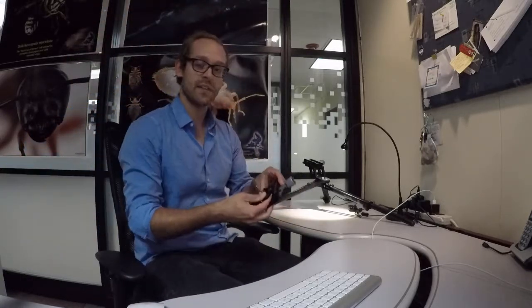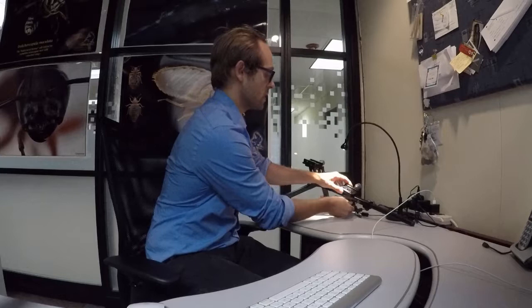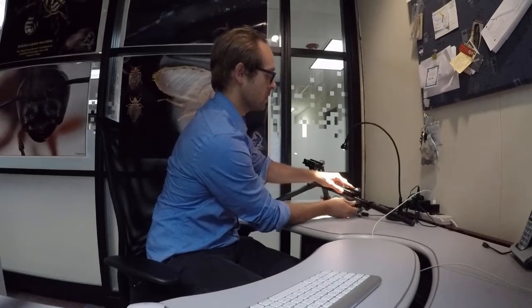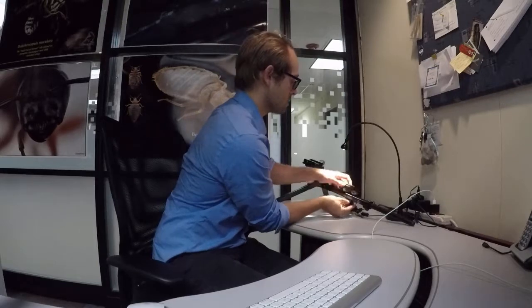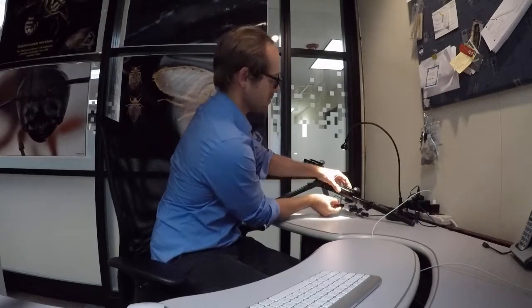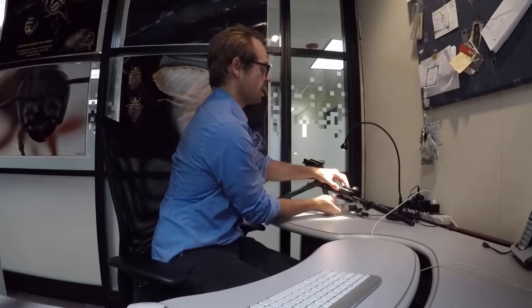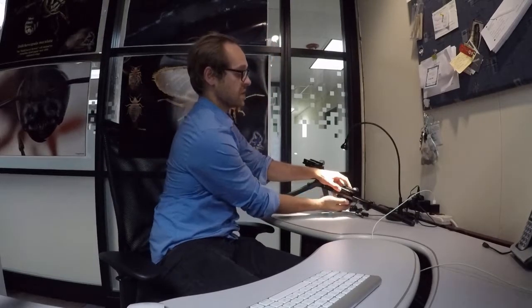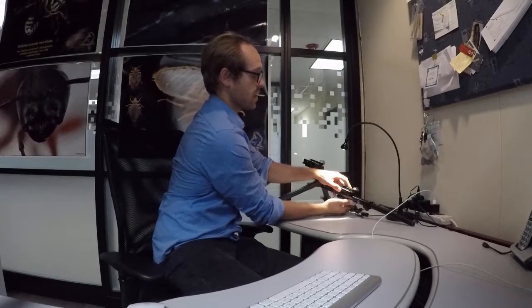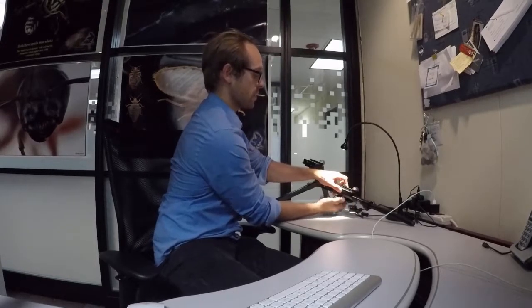Same as always, we're going to take the adapter plate and we're going to screw this through the bottom leg. And again, it's really important to just press on one side so that it's snug and straight along one side of the rail system.